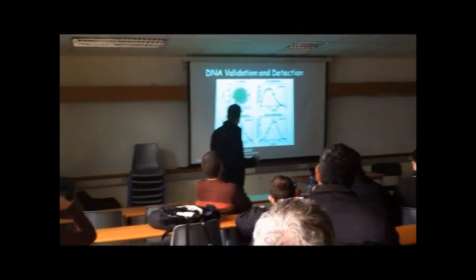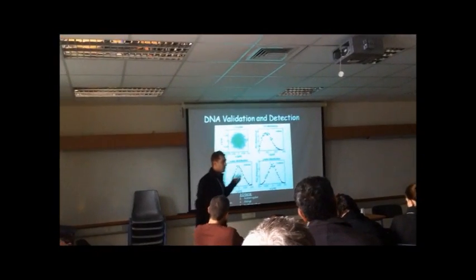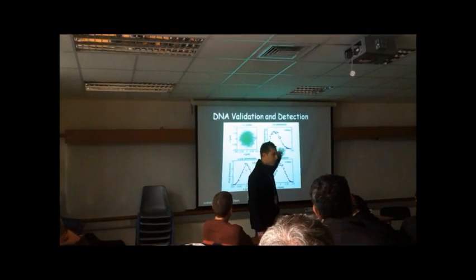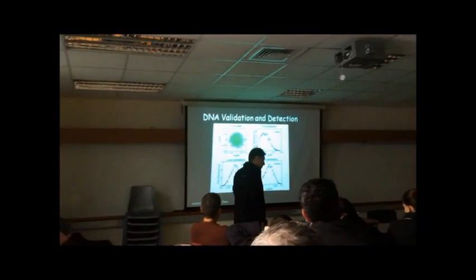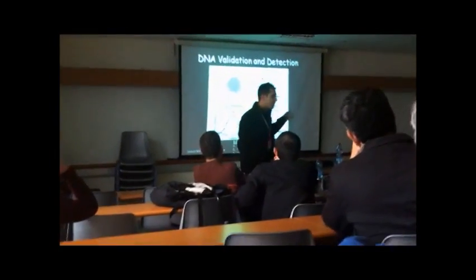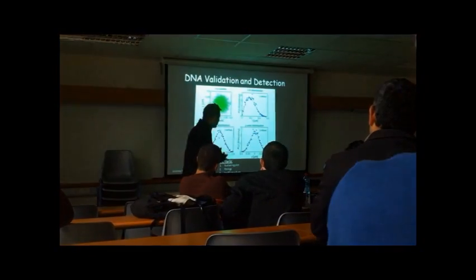So we have 3 criteria of checking this. The first one is to look at the scattering plot, and the scattering plot should be round due to the nature of the random walk. The second criteria is to look at the goodness of the fitting of our data, and you can see in the dot plot the experimental data. And the next criteria is to look at the persistence, which is according to the literature about 50 nanometers. So if all of these criteria are fulfilled, then we move on and we introduce the protein to the solution.